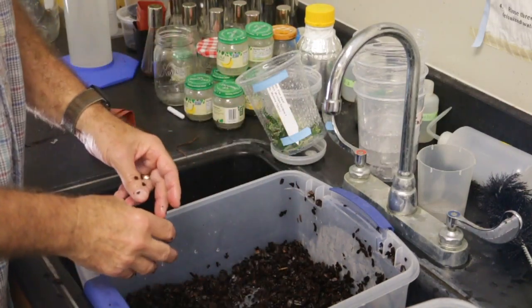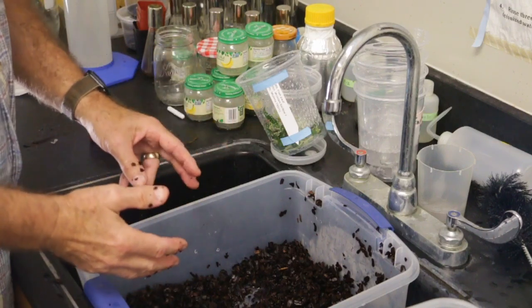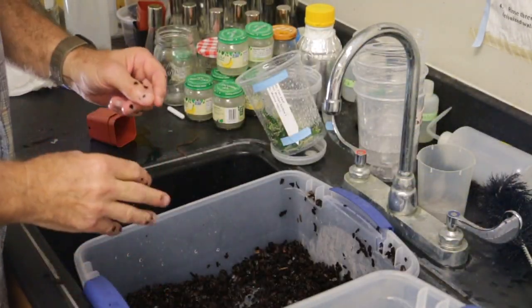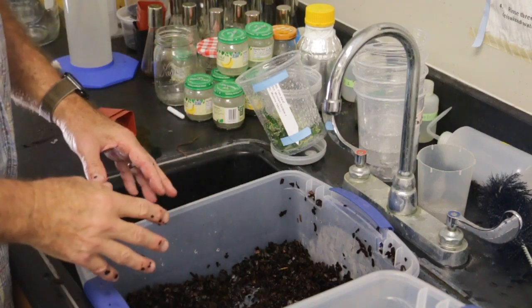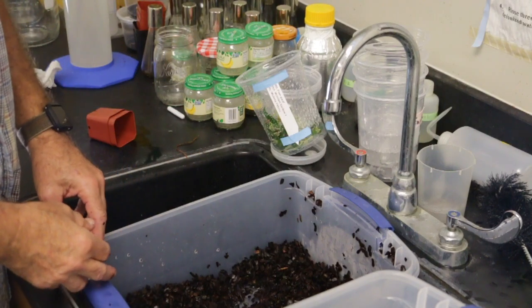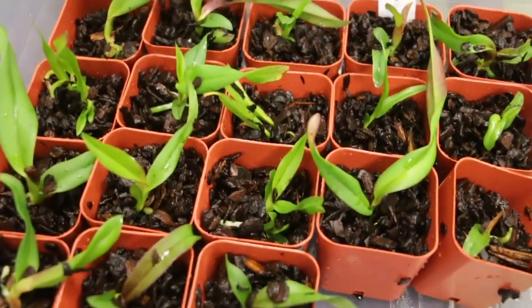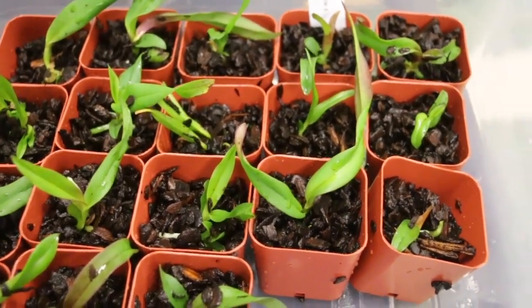Okay, so what I'm going to do is pot these up, show you how I treat the plants after I pot them off. What you can't see is where I was putting them. They're right here. I'll show you how I treat those things, and then we'll take a look at what these plants will look like 1 month and 2 months after deflasking. Okay, and so I potted up not all of them because I'm a little tired because I've been doing this for a few hours today.